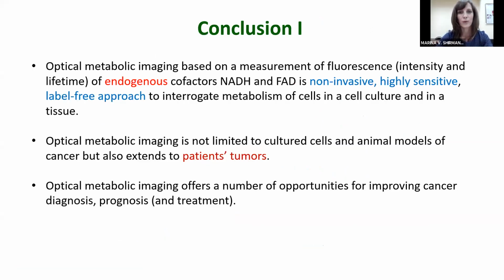From this part of the talk, we can make the following conclusions. Optical metabolic imaging based on measurements of fluorescence intensity and lifetime of the endogenous cofactors NADH and FAD is a non-invasive and highly sensitive label-free approach to interrogate metabolism of cells in a cell culture and in a tumor in tissue.